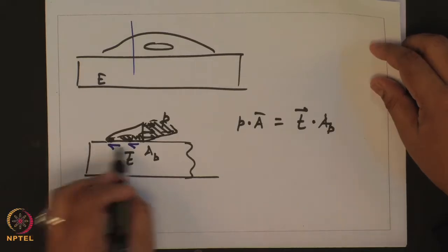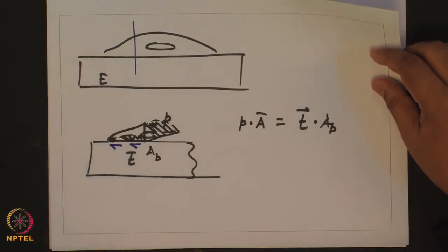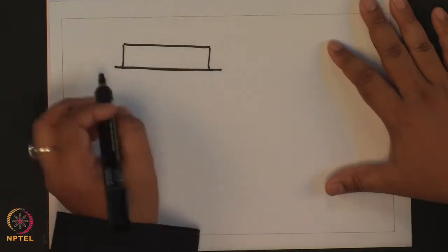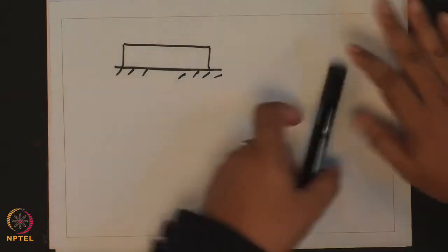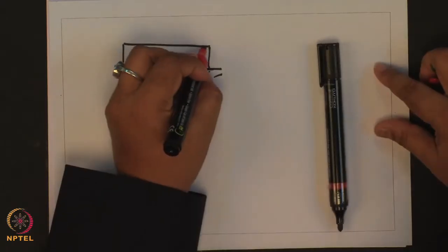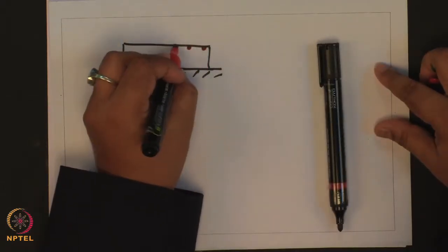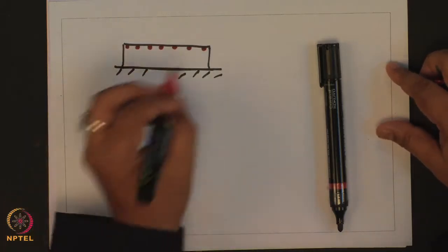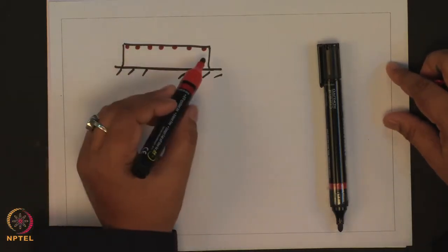But how do you measure these tractions or these forces on the substrate? What is typically done is, in the PA gels or PDMS gels that you fabricate, you put some fluorescent beads on the surface. And how do you get these beads on the surface?